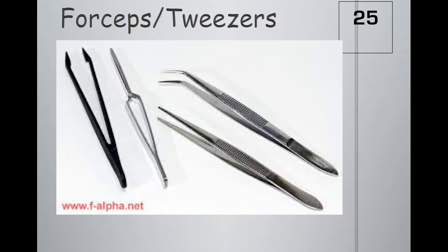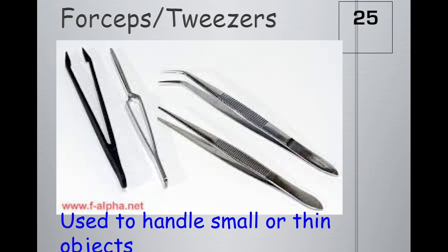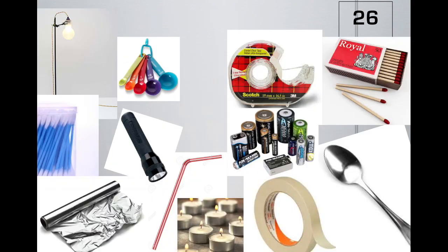These items here are known as forceps, also termed tweezers, and they're used to handle small or thin objects, sometimes used in dissection, but I also like to use them in separation of substances.